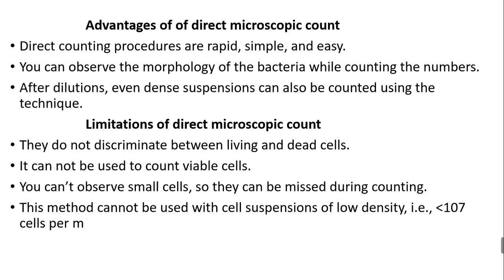Okay, these are the advantages of this method. This method is actually fast and rapid. You can observe the morphology of the bacteria while counting the numbers. If you place your microscope well and you project it well, you can actually view well.